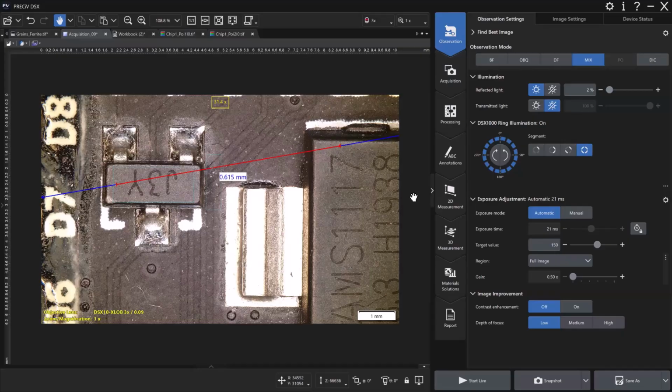If you take the next level and get a certified calibration standard, certain systems that we offer have calibration certificates that can come with our service engineering team, who do what they call traceable calibrations to very certified standards. That can be done in this software on certain systems that we offer, like the digital microscope, or laser scanning or measuring microscope, the STM7. They have the ability to have certified traceable calibration.